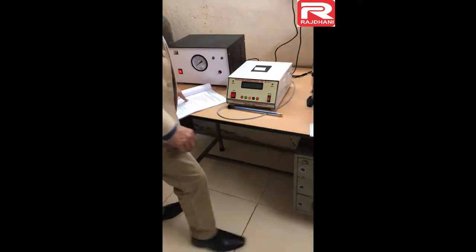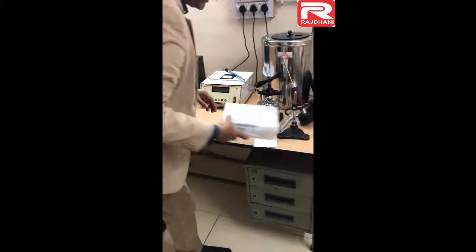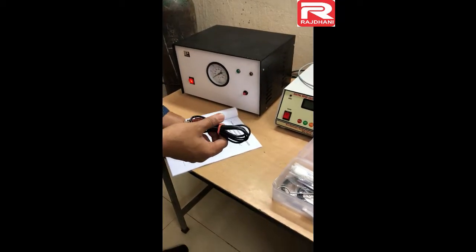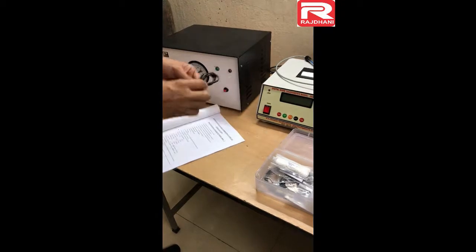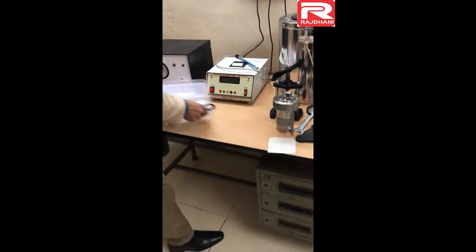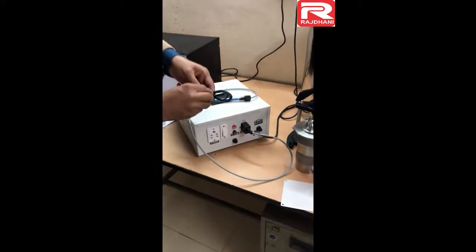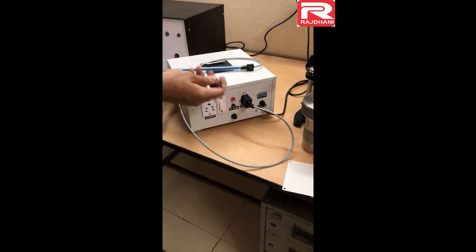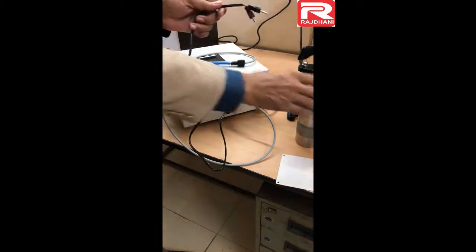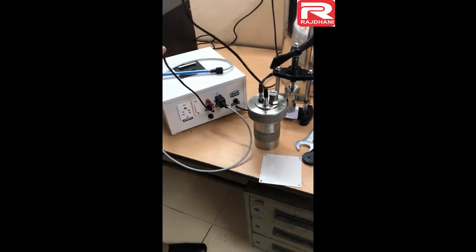The next part is the connecting lead. These are the accessory box items. Item number 13 is the connecting lead. This connecting lead is connected from the red and black sockets on this unit — red goes into red, black goes into black — and the other part connects to the terminal on the bomb. Either red or black can go into either part of the bomb terminal.